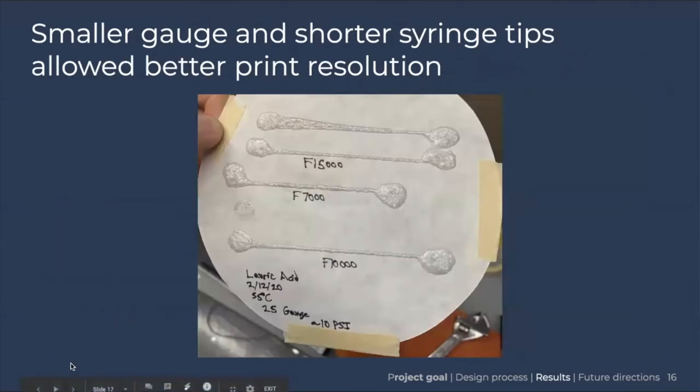We also tried smaller gauge and shorter syringe tips, both of which led in a promising direction for better print resolution. We went from using one-inch syringe tips to half-inch syringe tips, and the new syringe holder from the machine shop this semester allowed us to increase the gauge size — increasing the gauge number decreases the actual tip diameter — which allowed us to print finer lines. The image here shows low print variability and much finer lines than we achieved previously.